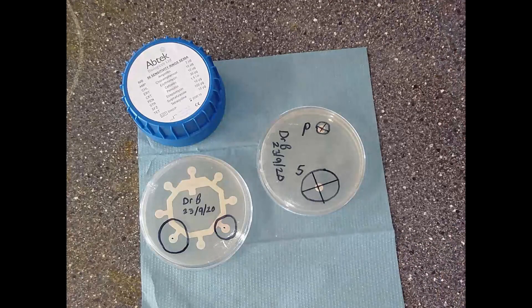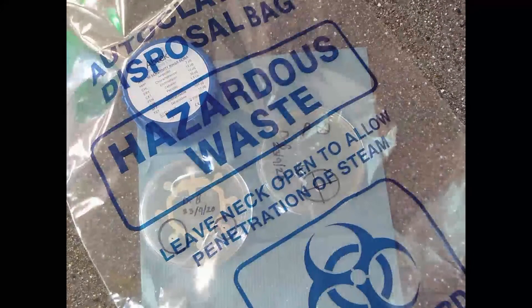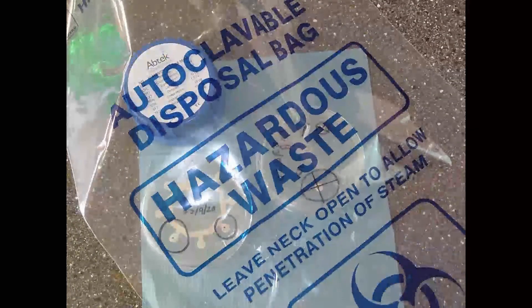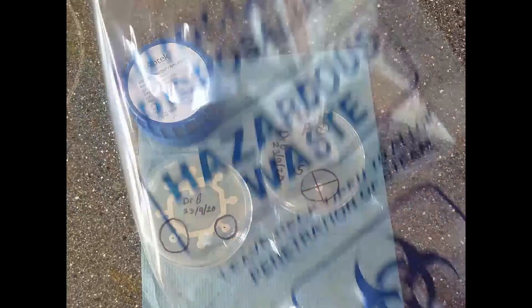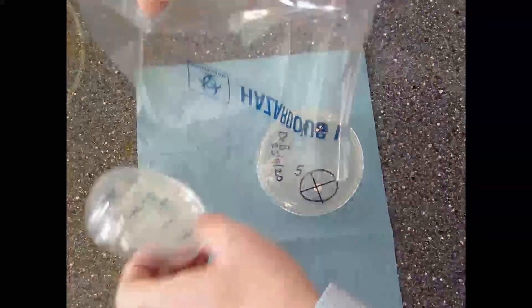Last thing I need to do - what I have here is an autoclave bag. This is to dispose of the petri dishes safely. I don't open them, I don't expose the bacteria. I'm going to place them very carefully into a bag. One, two, three. I've placed them in the bags and we are going to seal those up. They will be autoclaved. An autoclave basically uses steam under high pressure.